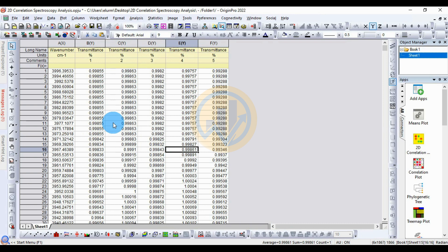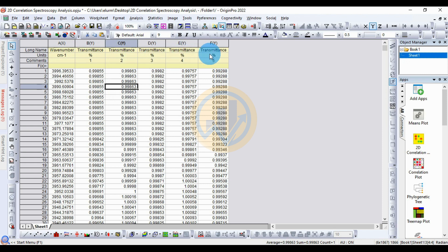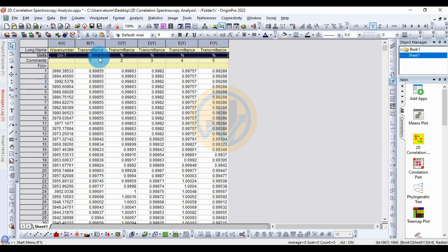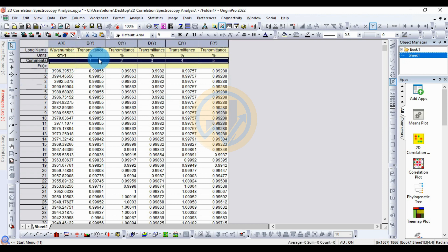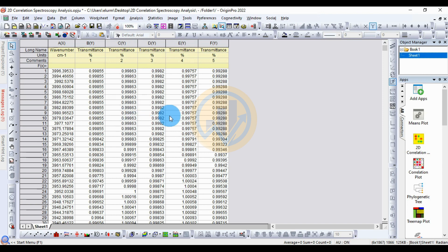Now we will discuss the topic of 2D correlation spectroscopic analysis in the ArginBro software. This is the dataset for the FTA data set. The data set is already entered in the ArginBro worksheet. The unit column is mentioned for units, and the commands column is mentioned for our sample names. I have five sample names: one, two, three, four, five.